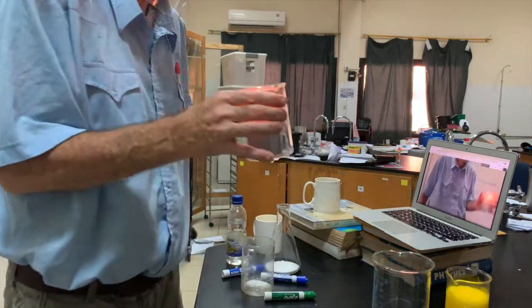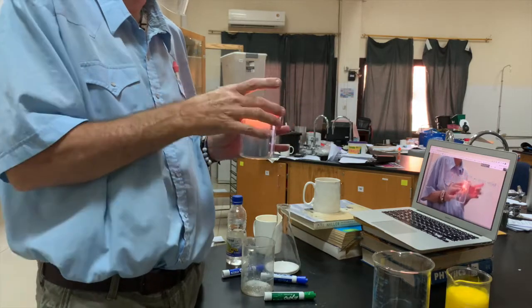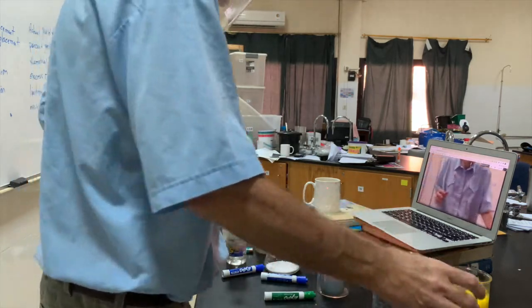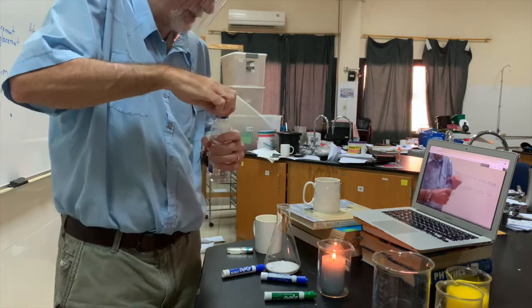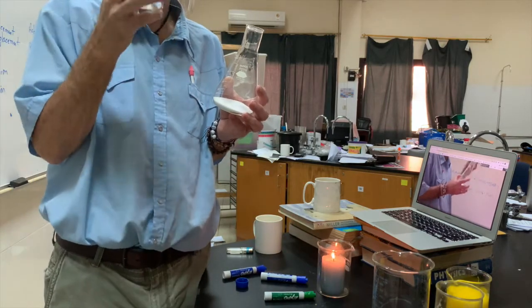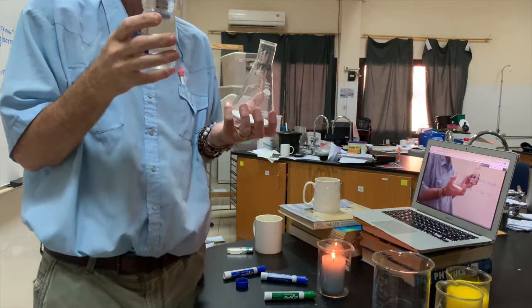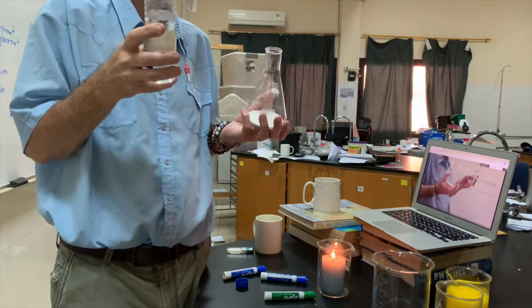Now the next one is actually kind of fun, okay? This is exactly what it appears to be, and we're going to talk about it in a minute, but this is a candle. Nothing weird, it's just a candle. Okay, can you see that? Yes. Okay. Now, I'm going to take some acid, okay, and I'm going to put it in here, okay? You ready? Yes. So this is acetic acid. It's actually a very dilute solution. Glacial acetic acid is very concentrated, but this is more mild.